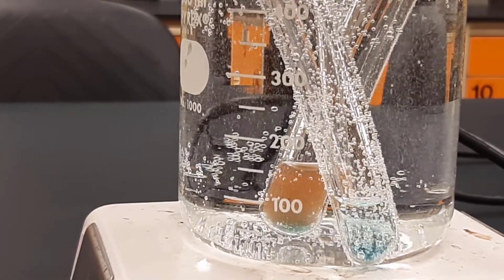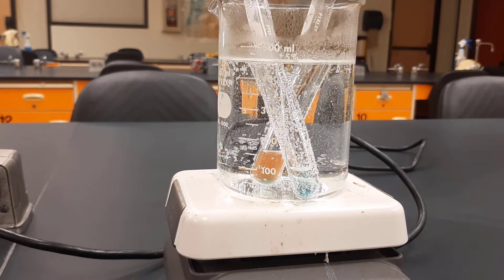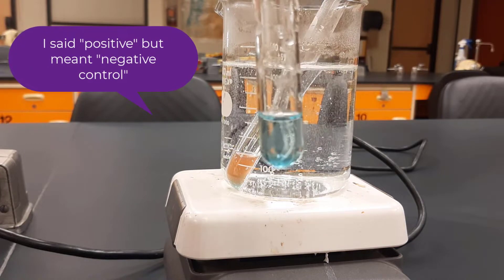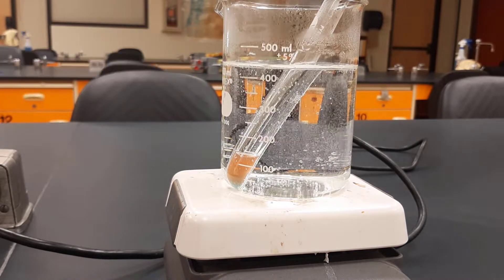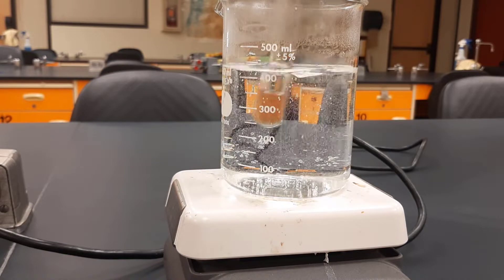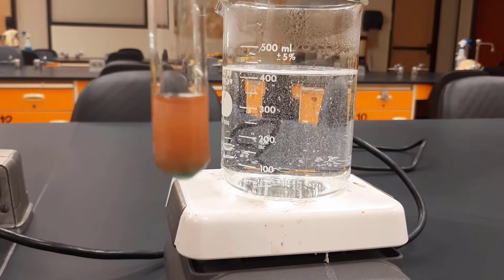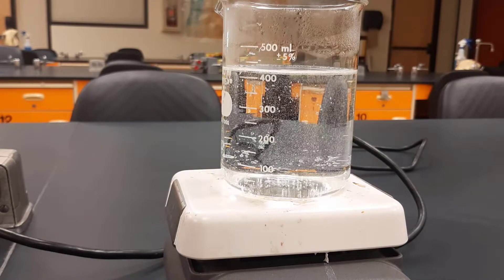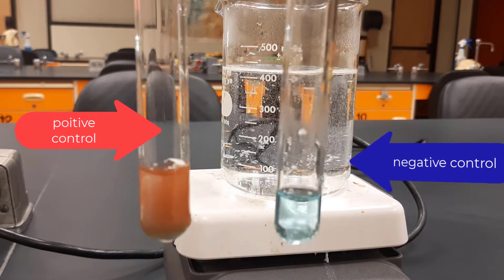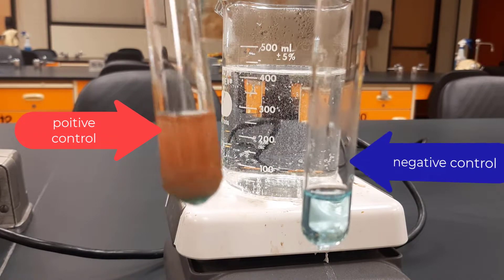All right, let's take a look. This one right here was our negative control — see how it's still blue, just like it was when we started? And this one is our positive control, and it turned color. So the blue one is our negative control, and this one is our positive control. We did not expect the negative control to change color, and it did not. The glucose solution, our positive control, did turn color.